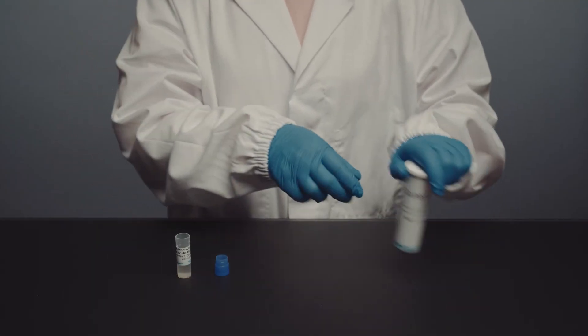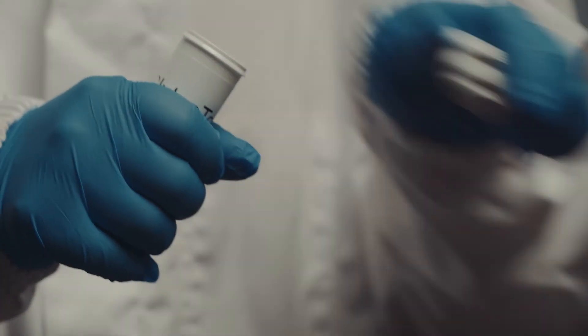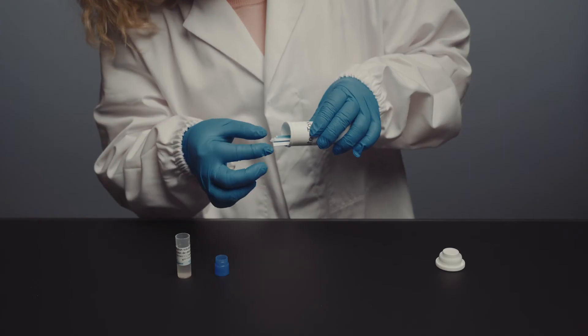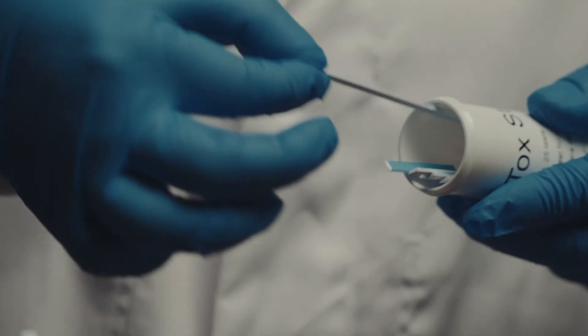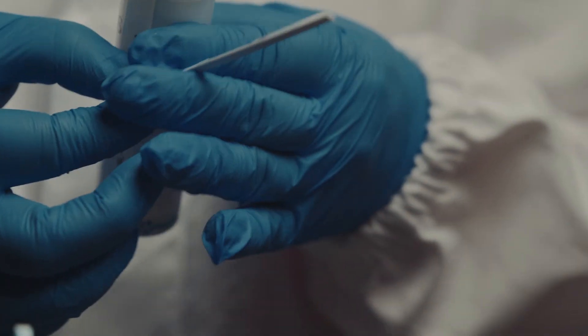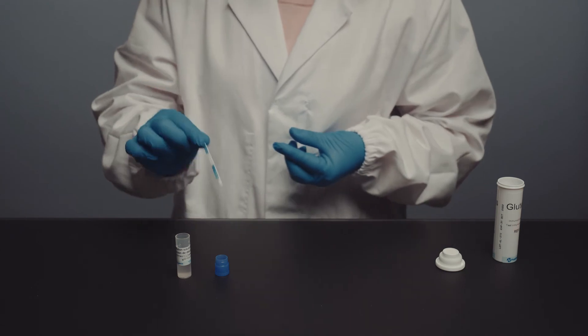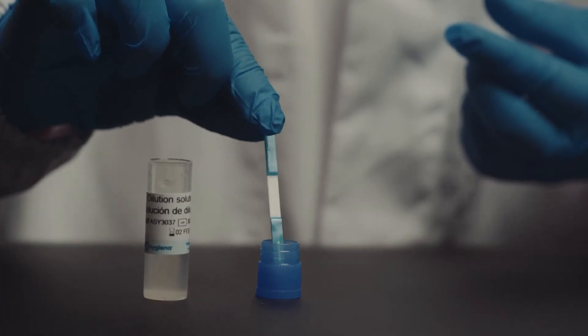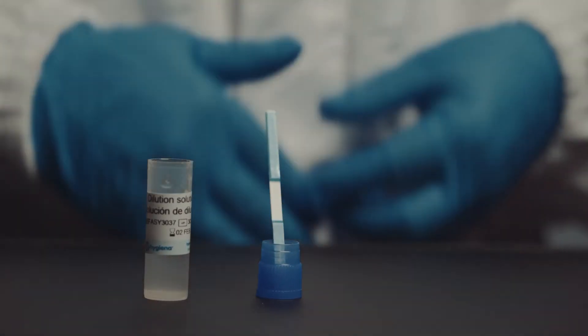Step eight, open the tube that contains the Gluten ToxPro sticks and carefully remove one stick without disturbing the rest. Step nine, place the cotton wool side of the strip, meaning the sample zone, into the blue cap.